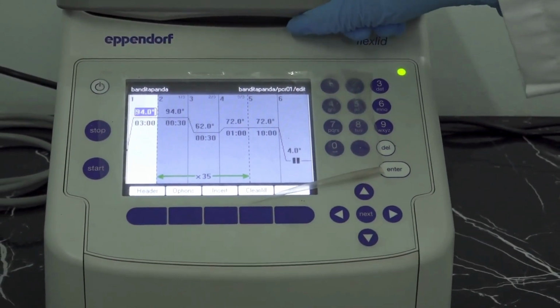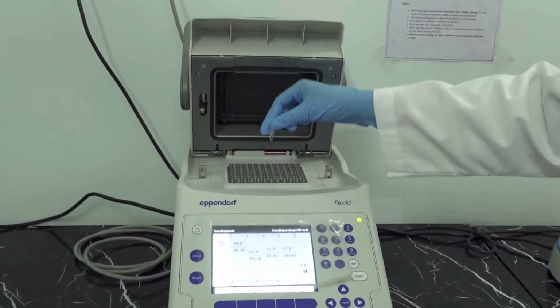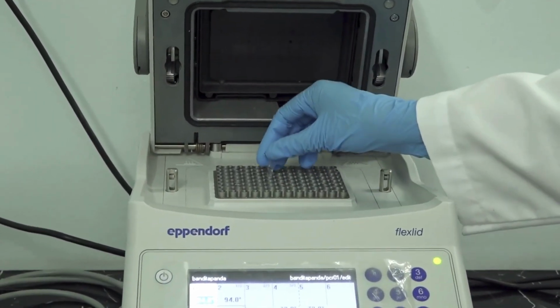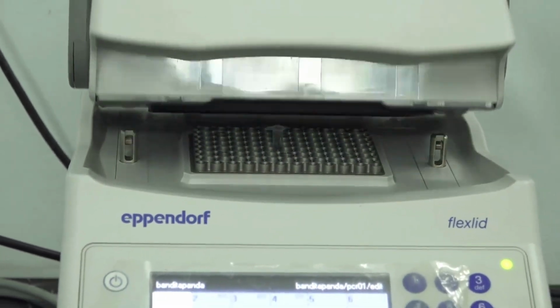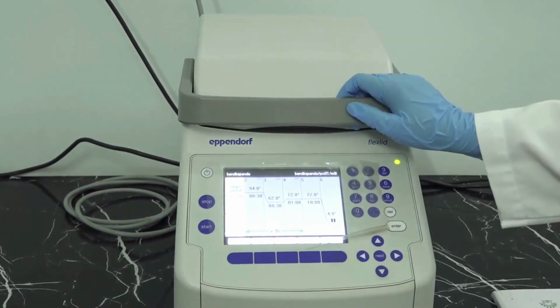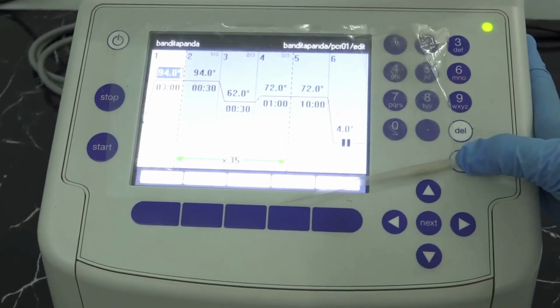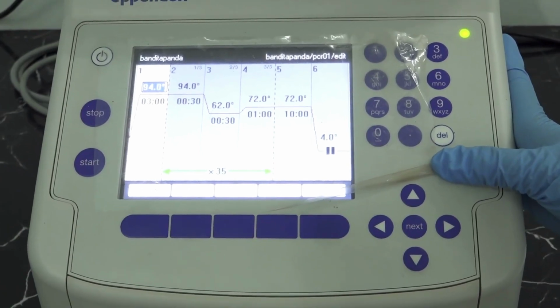Initial denaturation, typically at 94 degrees Celsius for 3 to 5 minutes to denature the DNA. Cycling: repeated cycles of denaturation, 92 to 95 degrees Celsius; annealing, 50 to 70 degrees Celsius, depending on primer melting temperature; and extension, 72 degrees Celsius or higher. The number of cycles is usually between 30 to 40.